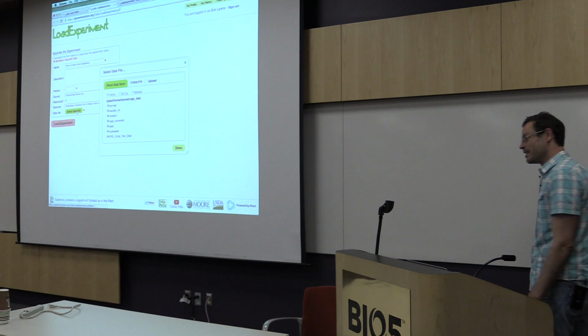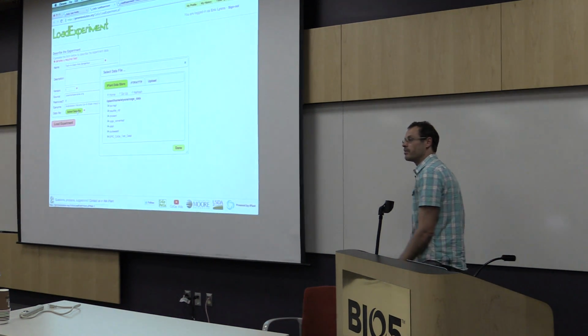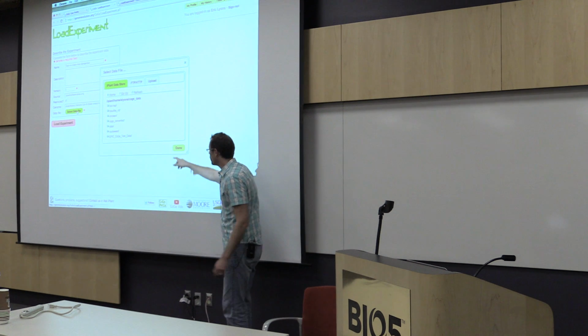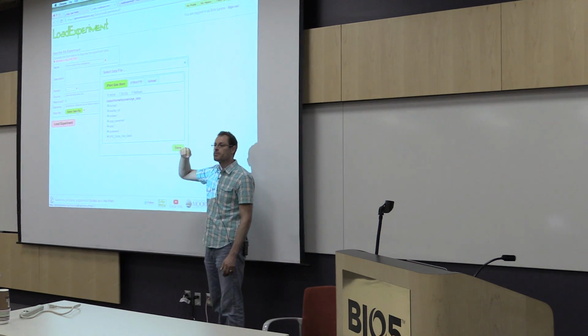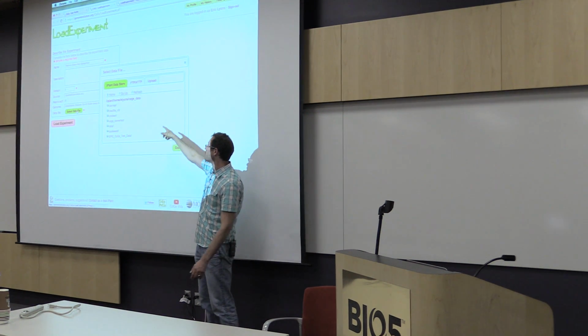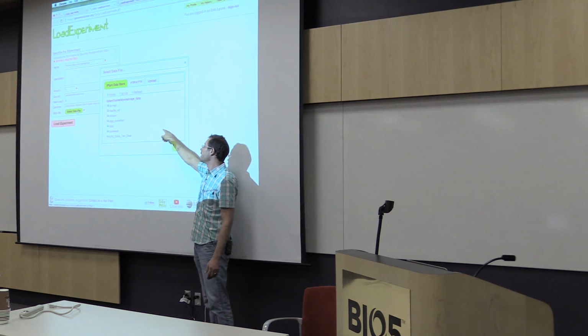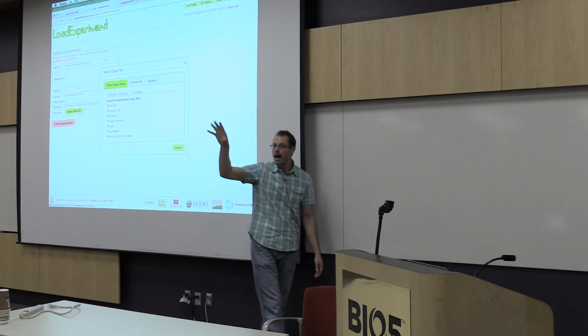So, add data files. Select data files. CoGe lets you pull data from a variety of places. You can upload it from your desktop. What it's doing is going into a special directory inside your data store, under the iPlant data store tab, specifically a directory called CoGe_data, and it'll let you pull data out of your directory.